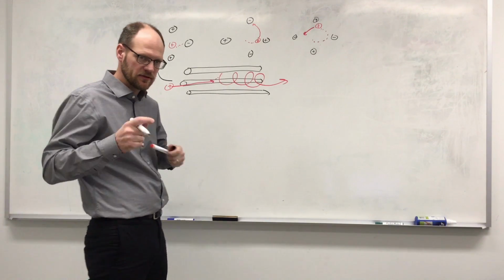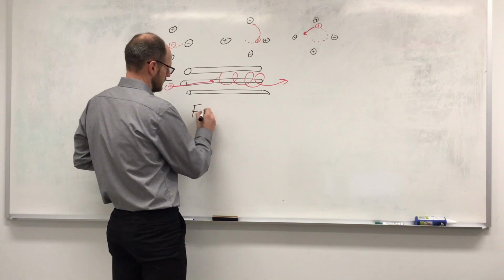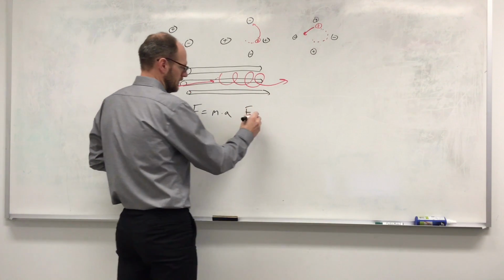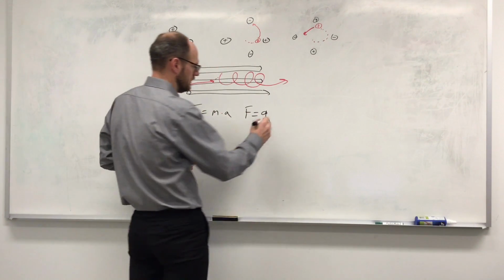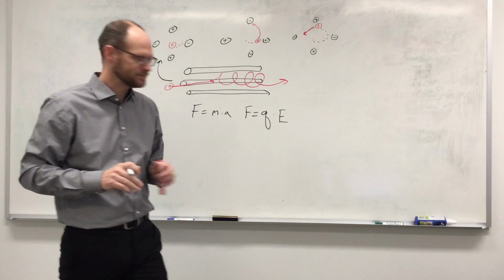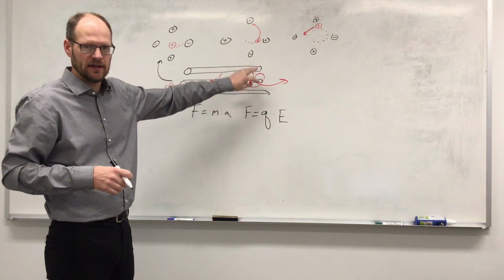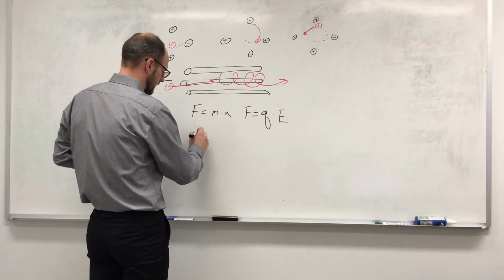And that can be understood through basic Newtonian physics. There are 2 definitions for force. One, which you all learned in high school, force is equal to mass times acceleration. The other definition of this, which you may or may not have been exposed to, is that it's proportional to the charge of a particle multiplied by the electric field a particle is experiencing. So using these 2 classic definitions of force, you can actually come to understand why the particles respond in a mass to charge kind of way. And you can get there just by rearranging this equation.